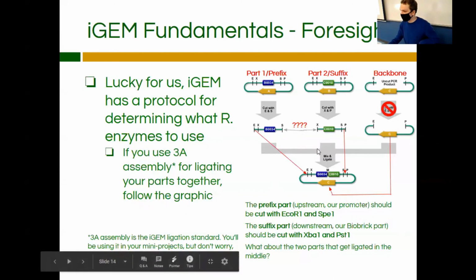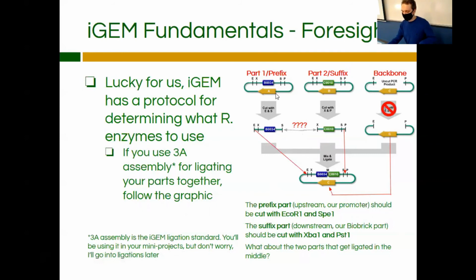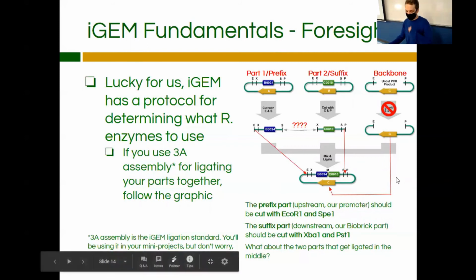The main thing I want you to take from this lecture/meeting is you cut the prefix with E and S, you cut the suffix with X and P, and you don't have to cut the backbone. Next week, I'm going to be going over 3A assembly in detail, this whole thing in detail. You can worry about it then.